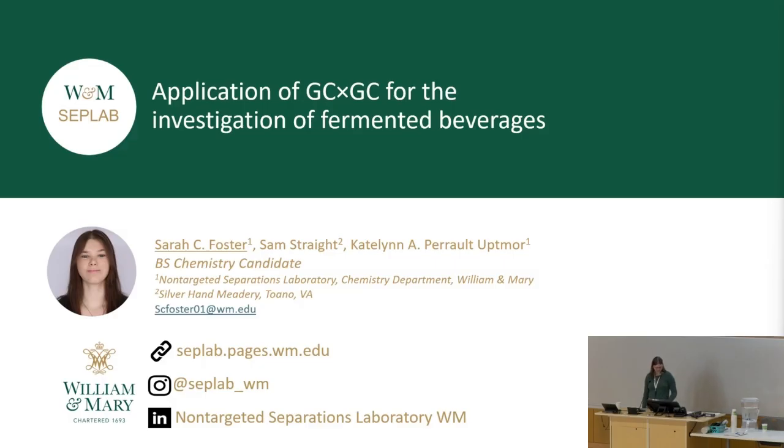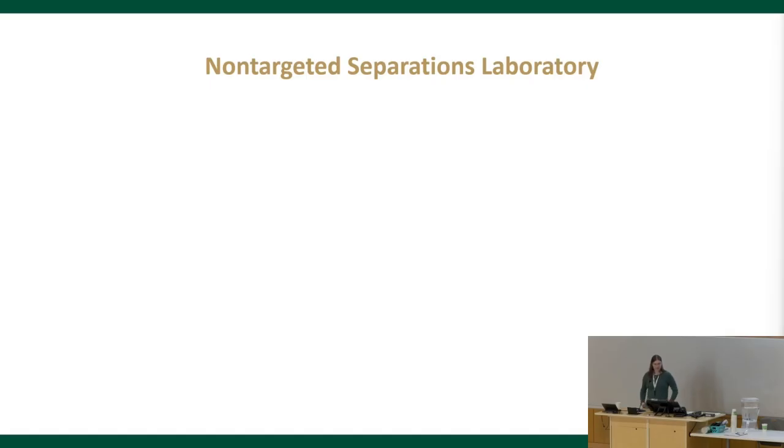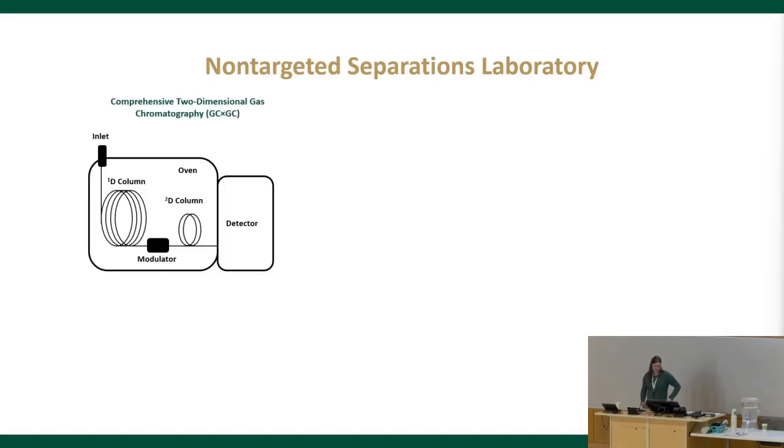Today I'll be discussing our research on the application of GC×GC for the investigation of fermented beverages. In our lab, we mainly focus on the use of comprehensive two-dimensional gas chromatography, or GC×GC, for the separation of volatile organic compounds and identification.